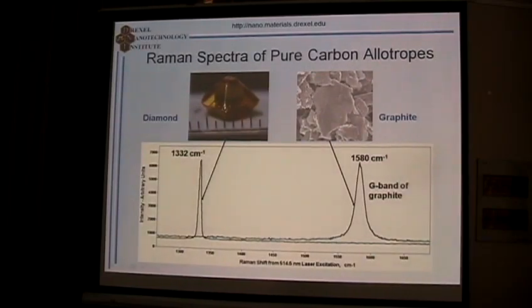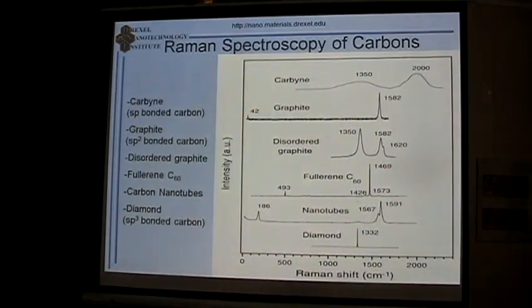First, this is a fast and easy way, so if anyone here has a sample for analysis, within a minute we can tell you whether this rock that you got from your boyfriend, your fiancé, is a real diamond or not, or if anything has been done to this crystal, for example, irradiation to improve its color. Of course, it is also equally widely used for graphite.